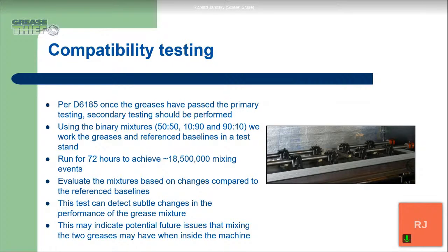And then the aforementioned testing that we just talked about, we will evaluate those mixtures and we'll see, have they changed as expected, or is there an unexpected change? Has the grease gotten very soft, very hard, what have you, in the testing results? So this would be helpful, as I mentioned, in the potential future issues that mixing the two greases might have.